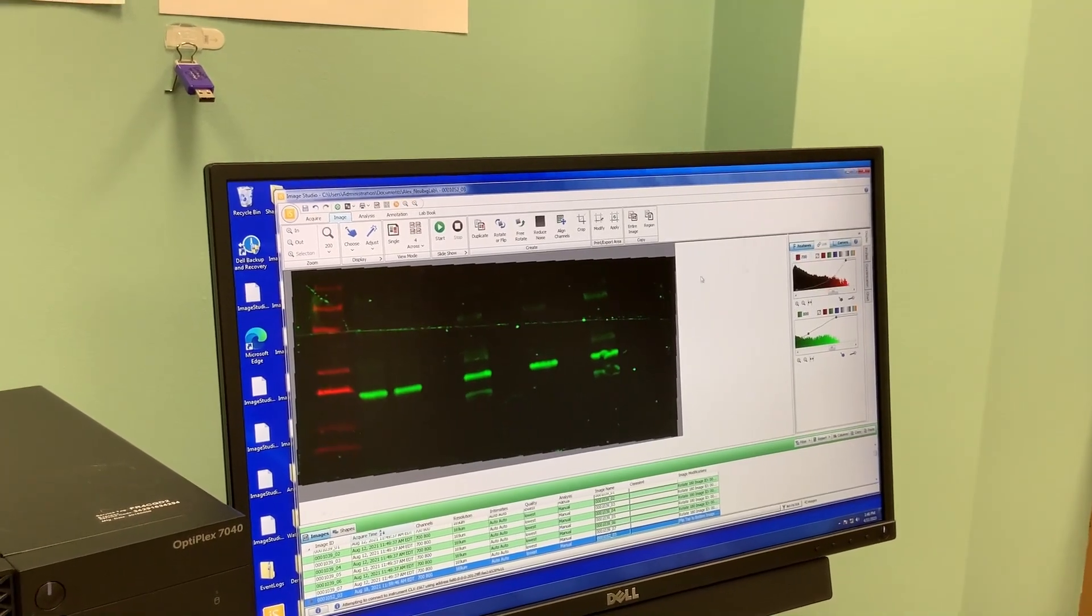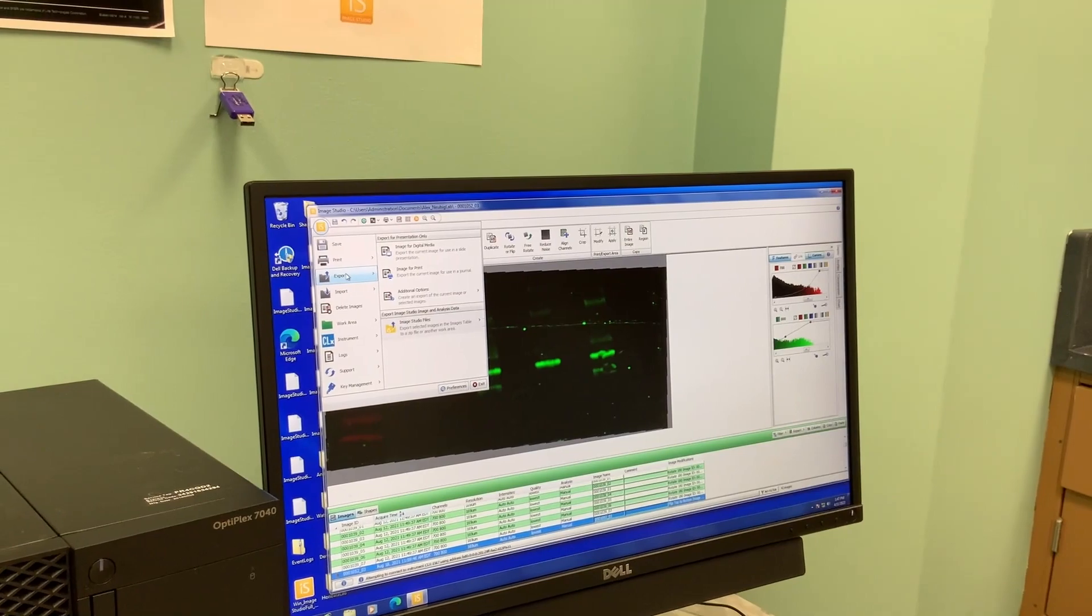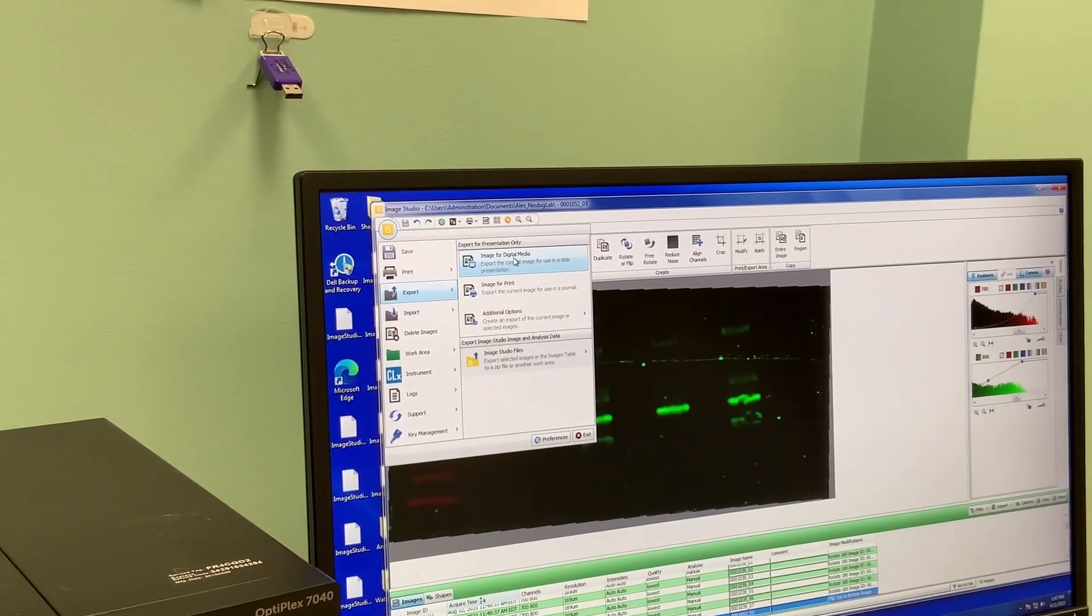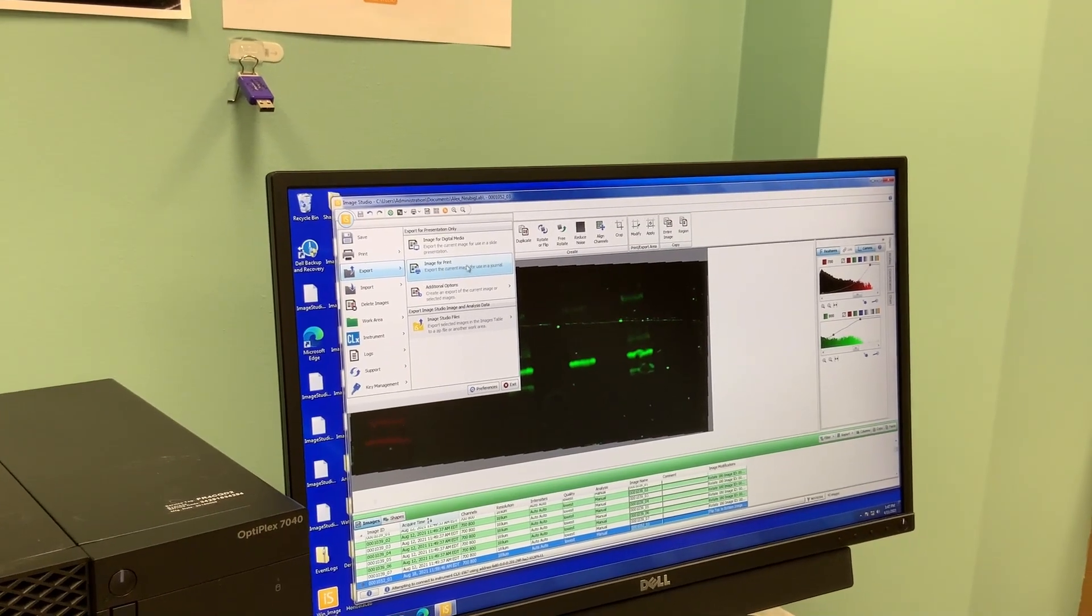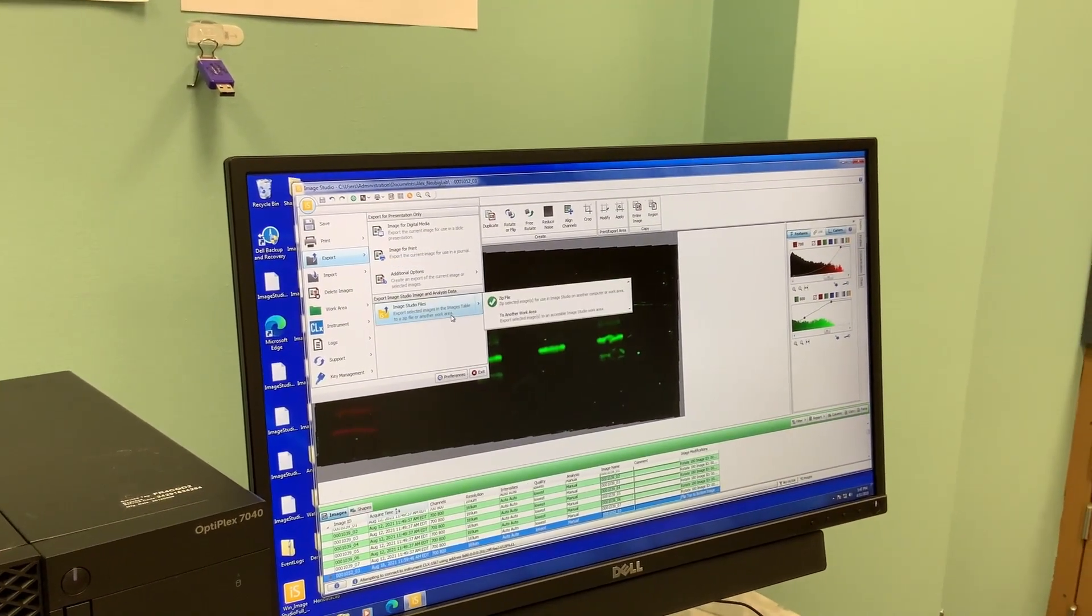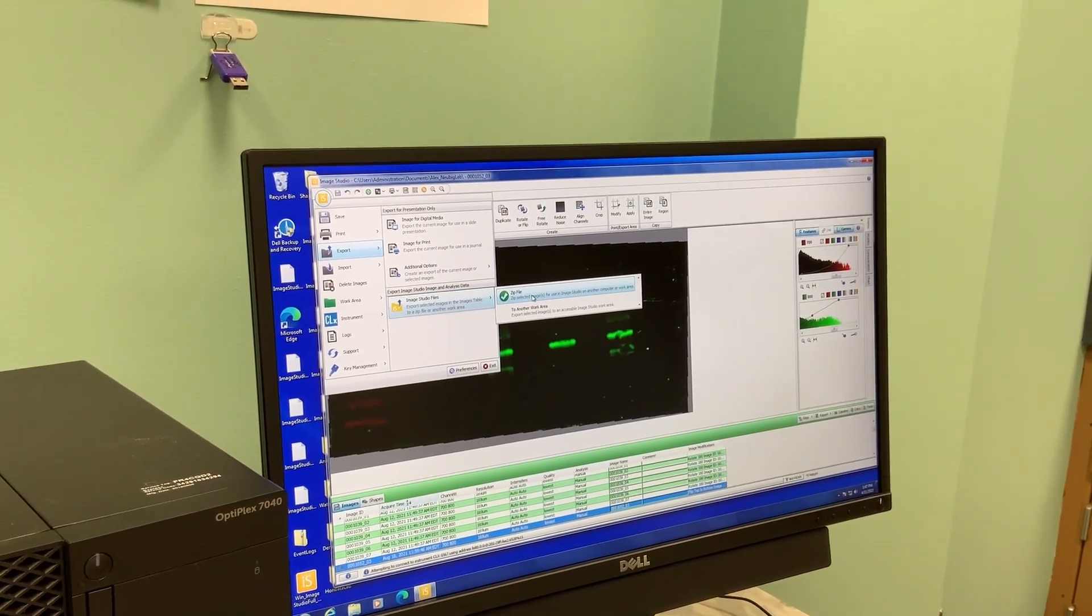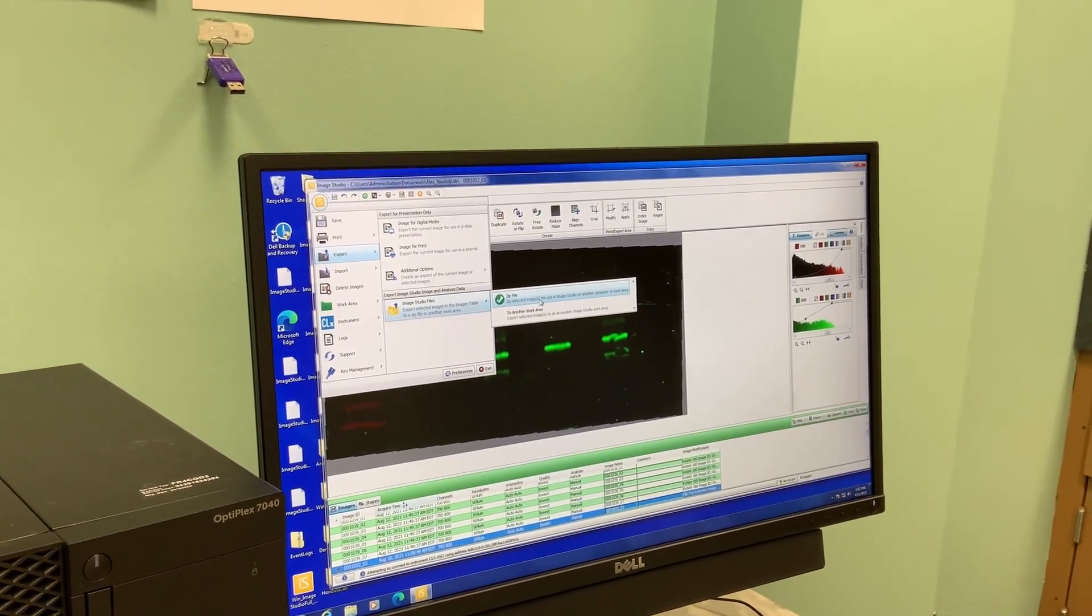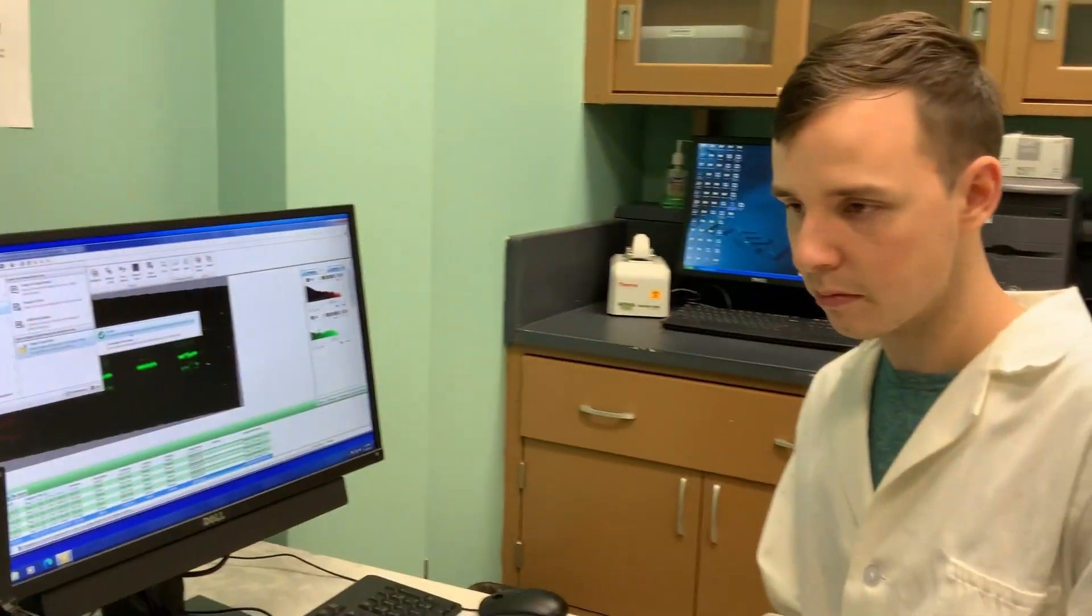We can go up to the menu and go to Export as digital media for like a presentation, or if you were going to print it you could do a print format. There's this Image Studio file and you can hit zip file, which is really a great option because this will allow you to take the zip file to your computer and put it on the network drive in your lab for later use. Then you can open it in Image Studio Lite on your personal computer and you don't have to come back to this computer to edit your blots.